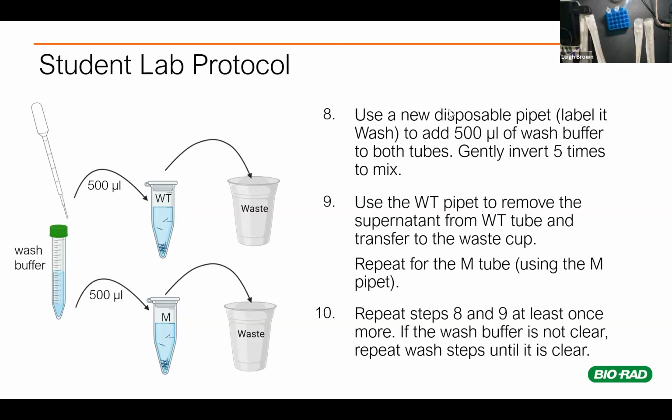Or the other thing to think about here is you still have a ton of worms back on those plates. And so if you do have a critical blowout where all your worms aren't in the worm pool anymore and aren't in the tube, you could have them start back over at the plate and rewash the plate again and start from the beginning. So those are two solutions for that issue.